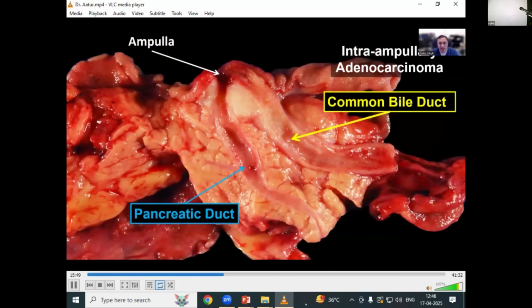As further proof of cutting along the ducts, a small intraampullary neoplasm can be easily missed without proper grossing skills. Again, I really harp on the fact that probing those ductal systems, cutting the specimen, bivalving it completely all the way through the ampulla, not leaving it like a book to be opened at the hinges, but rather cutting through the specimen itself, can really reveal a lot about what's going on with that neoplasm and where it's truly arising from.